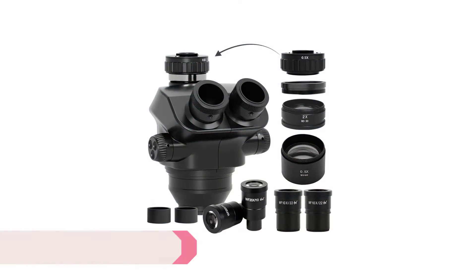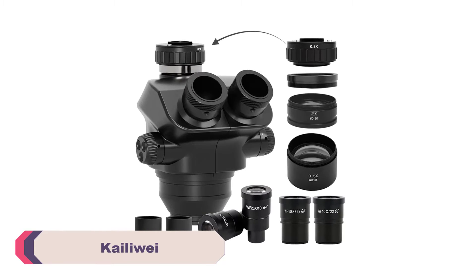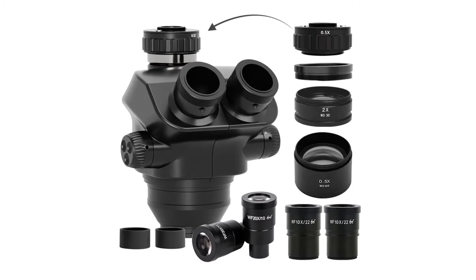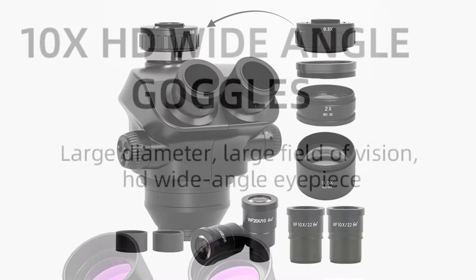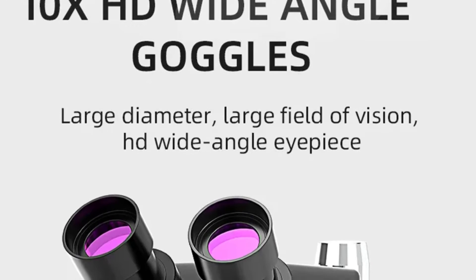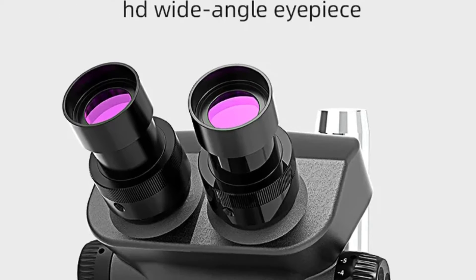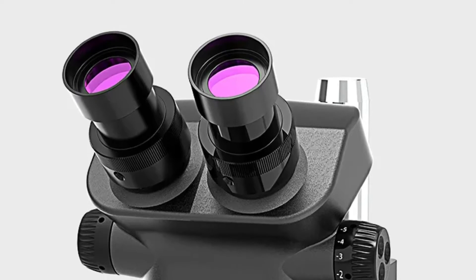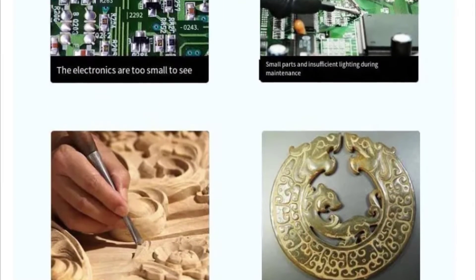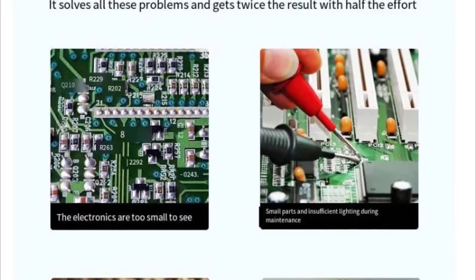Number 4: Kylaway Trinocular Stereo Microscope. The Kylaway Trinocular Stereo Microscope boasts a solid and durable metal construction. It feels robust and well-built, which is crucial for any piece of scientific equipment, ensuring long-lasting use and reliable performance. The trinocular design is a standout feature, allowing for seamless photography and video recording — a feature that is often lacking in many stereo microscopes. The additional eyepiece is perfect for sharing observations with others or documenting your findings, making it a great addition for educational purposes.